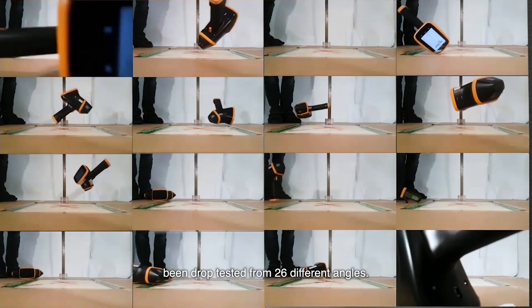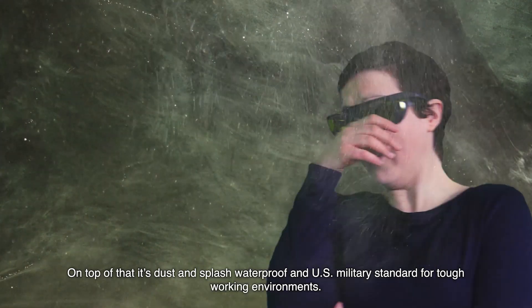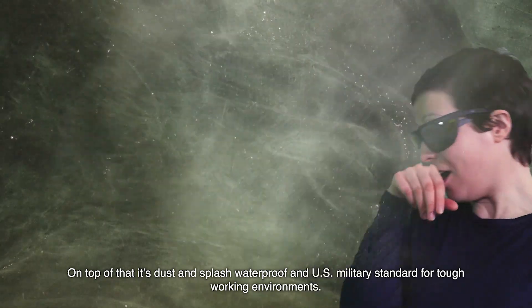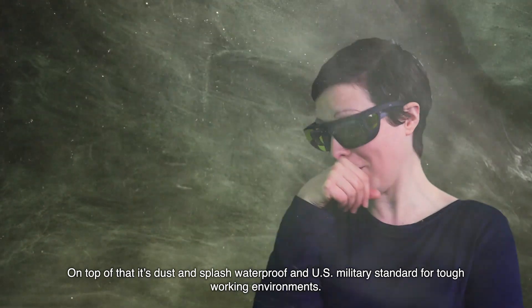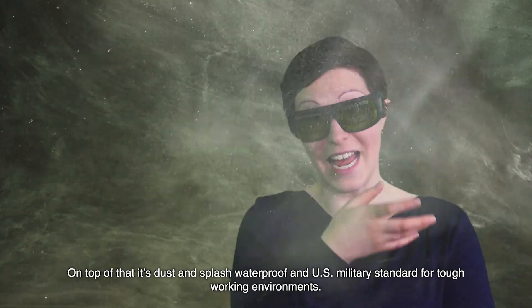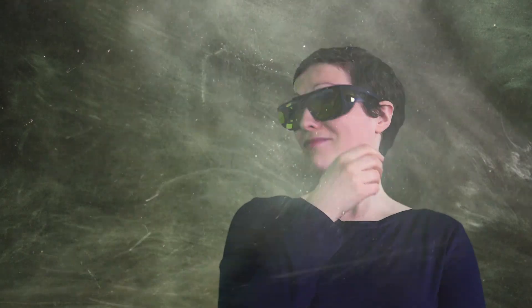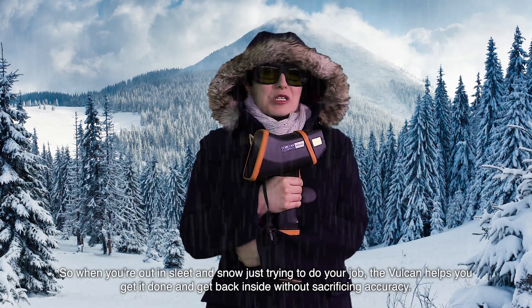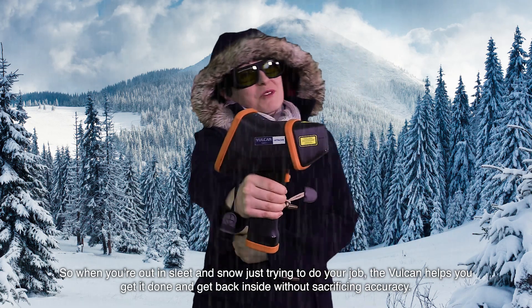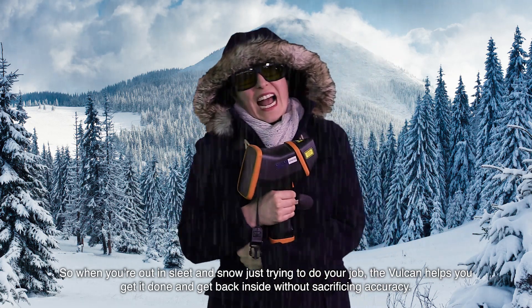And it's been drop tested from 26 different angles. Thanks for the reminder guys. On top of that, it's dust and splash waterproof and US military standard for tough working environments. So when you're out in sleet and snow, just trying to do your job, the Vulcan helps you get it done and get back inside without sacrificing accuracy.